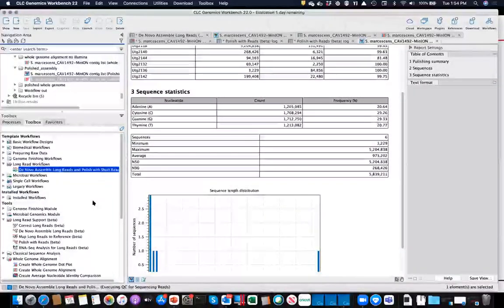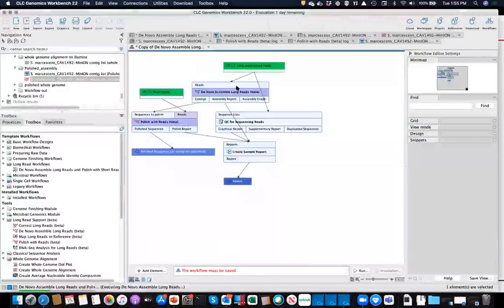And you could imagine that if my goal was to simply say, hey, just run that workflow, and all you have to do is point to this and this, it doesn't really lead to a long training session and give you a sense of all the different reports that are made and parameters that you have access to. So again, that workflow is just leveraging the tools that we had described today, the de novo assembly and the polished reads. And then it just exported one set of polished content. So I wouldn't have to do this as multiple steps.